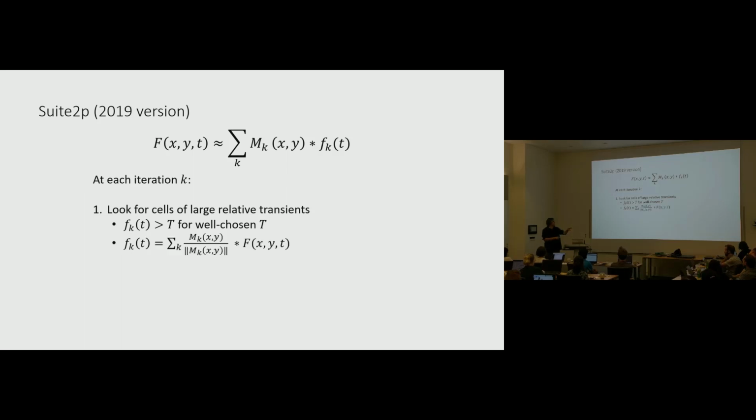So some frame T here has some kind of average activity in these pixels that's above some pretty large threshold that we set automatically in advance for all the cells. So if we find a part of this image where all the pixels on one frame went high together, very large, that's going to be our candidate for a new cell.